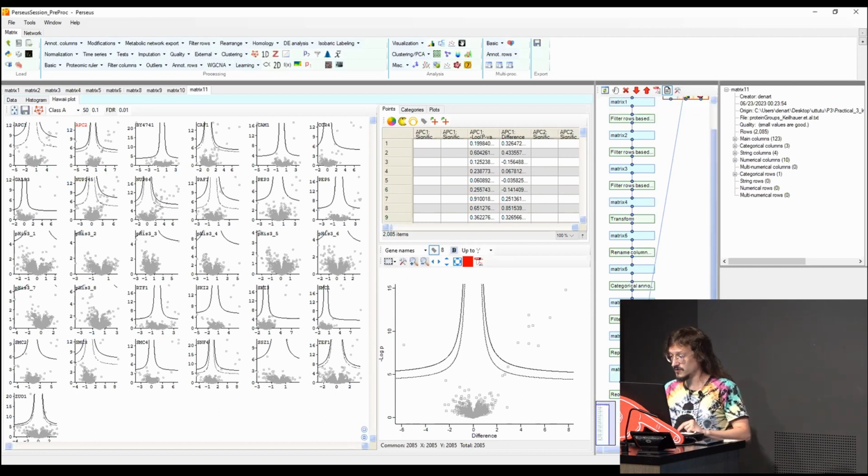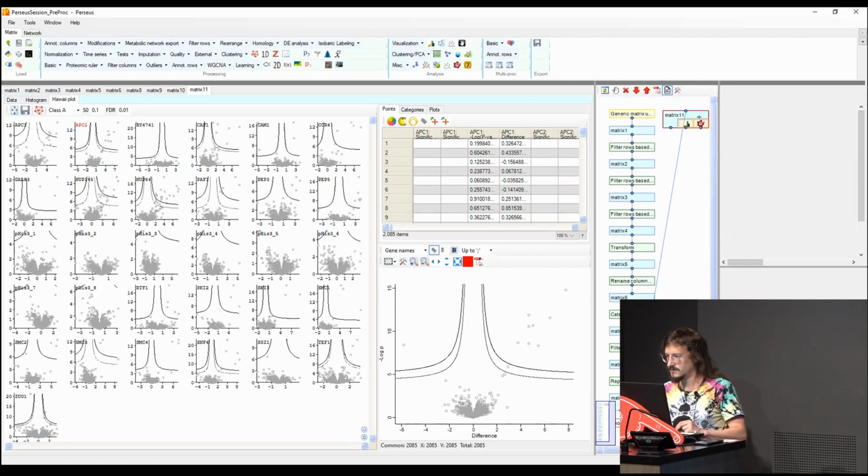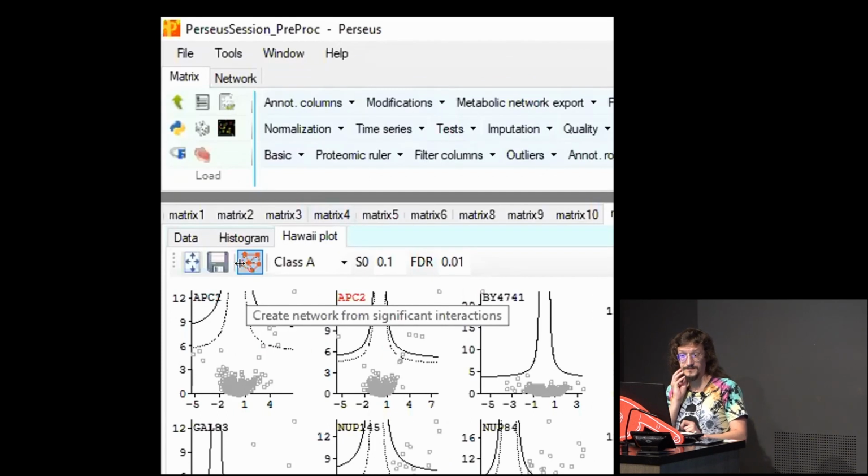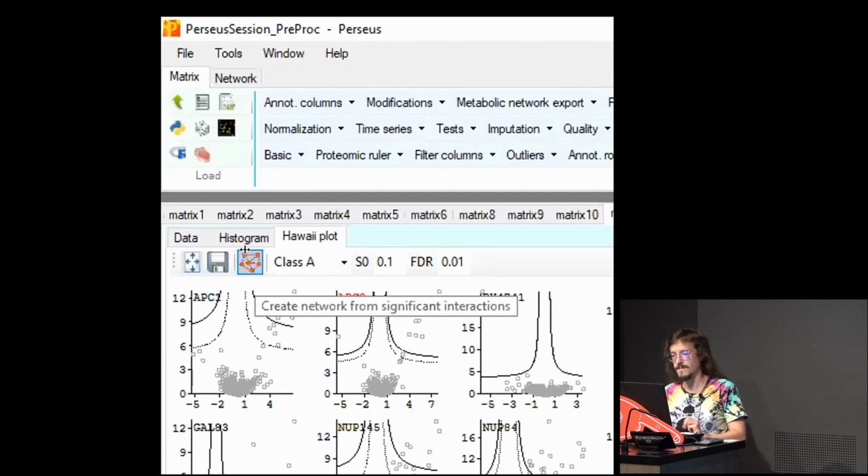The thing I wanted to show you, because now we talked about networks, but this is not a network. Where is it? Here. We have this button called Create a Network from Significant Interactions.